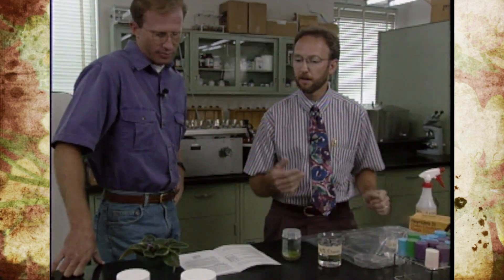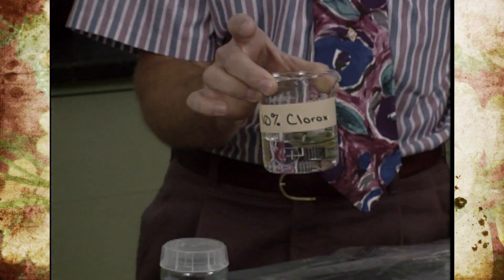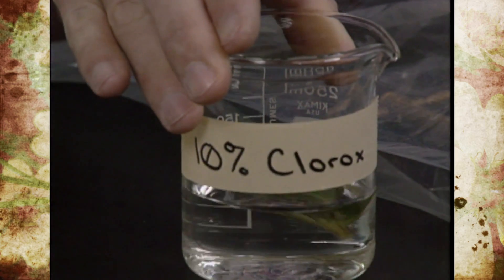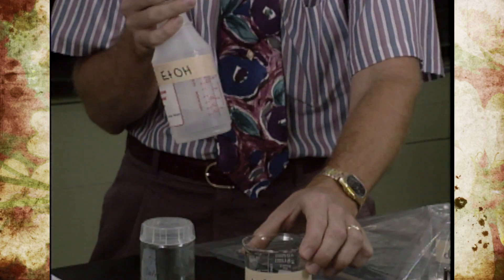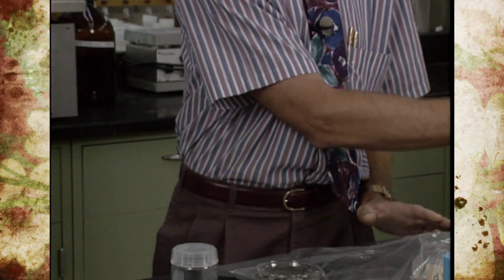The next step is preparing the plant part for introduction into tissue culture. We're using an African violet leaf, and the first step is to soak it in a 10% Clorox solution — made by adding one part Clorox to nine parts water. It needs to stay in that solution for 15 minutes. After that, we'll mist it down with 70% ethanol, which is similar to rubbing alcohol, and then place it into our sterile area.